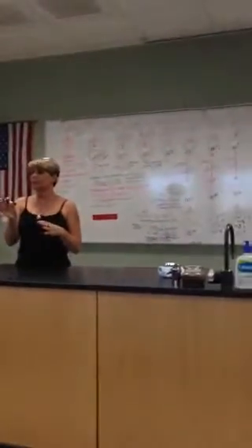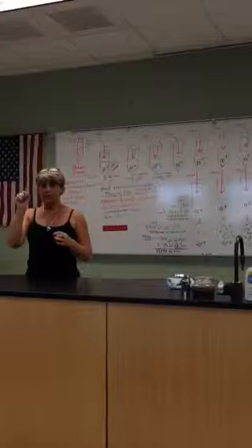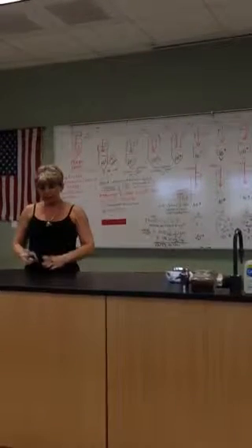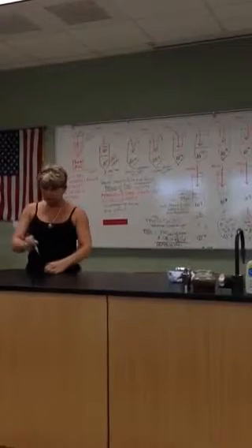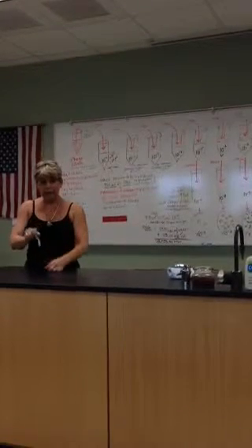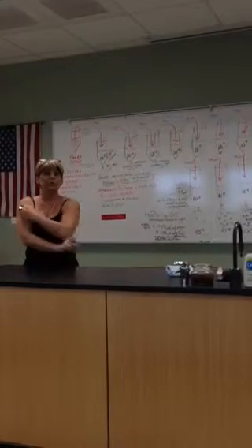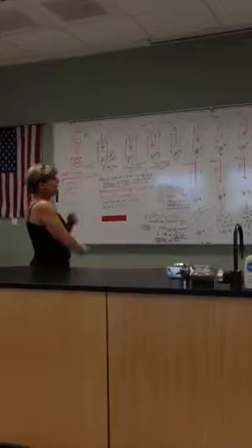I've had students take their plate and take a picture of it and put it in their art program, and then put dots on each colony in their art program. I've had other students just literally use their Sharpie pen and put dots everywhere they see a plaque and count that way by going 1, 2, 3 and literally dot them so they know which ones they've counted already. So it can be done.